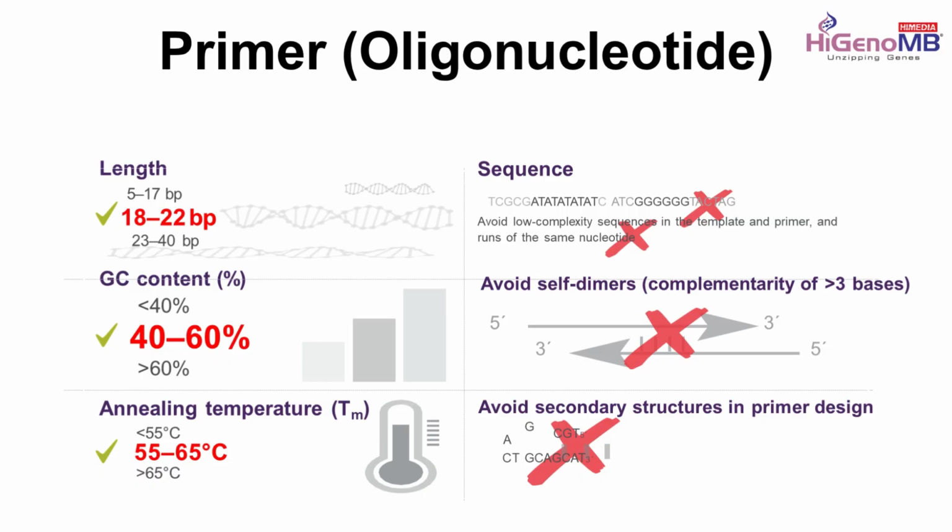Because of this, when I am using this primer in my PCR reaction, instead of amplifying the DNA or the gene that I want, I will be randomly amplifying anything and everything in the human genome, which is not my goal for the assay.